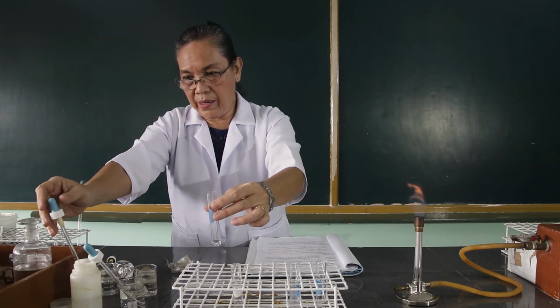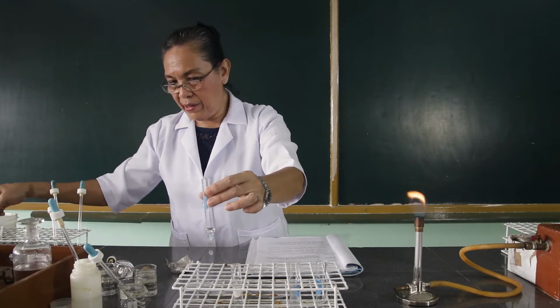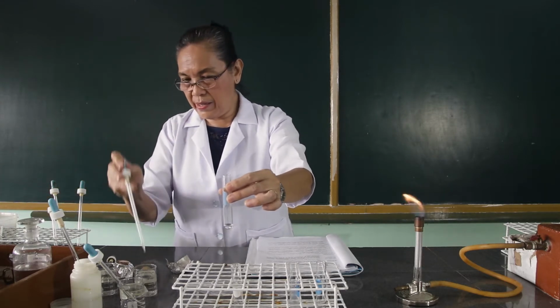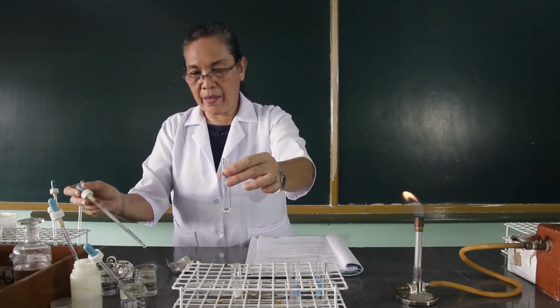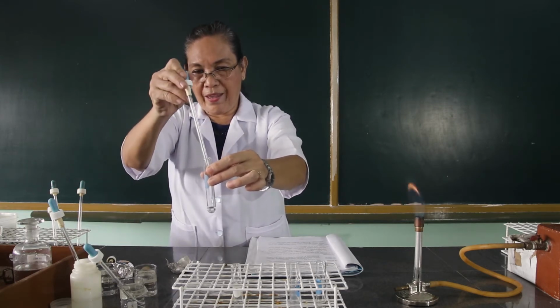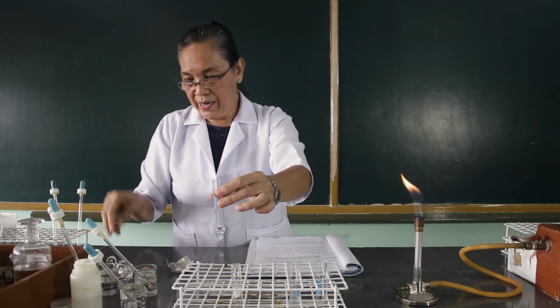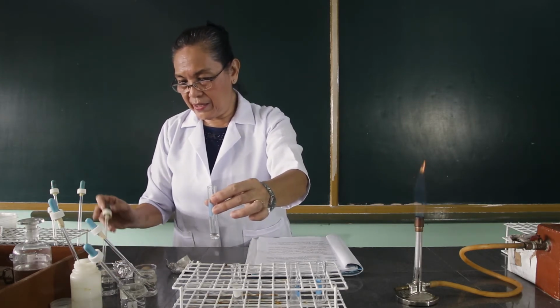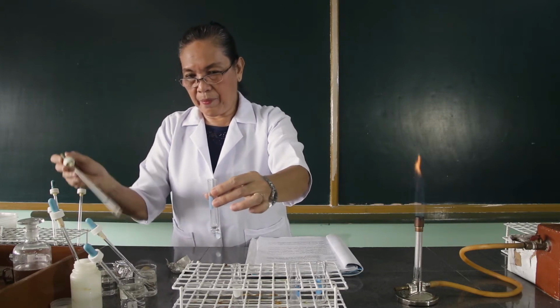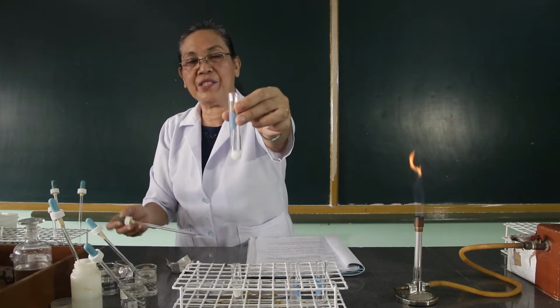Then we're going to add barium chloride. I'll get barium chloride. Barium chloride and ammonium carbonate. This is ammonium carbonate. Observe what happens.